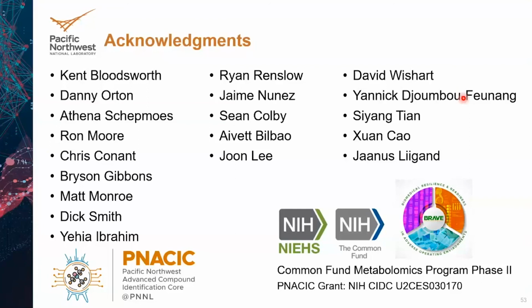And so, although I'm conducting analytical research, and although I'm in a large analytical mass spectrometry group, at the end of the day I mainly care about what these molecules mean, what these changes in the molecules mean in the context of the biology. So I definitely hear the intent of the question, and I definitely want to get there and have a method that works well, in terms of not only comprehensive identification but also assessment of identification false discovery rate. I want that like yesterday, but it's hard. We're sort of trailblazing here. I would like to see some reasonably good method within the next 5 years. Again, mainly so selfishly, so that I can use it myself in my own studies and not be frustrated by where we are with metabolomics relative to where we are with proteomics and transcriptomics, for example.